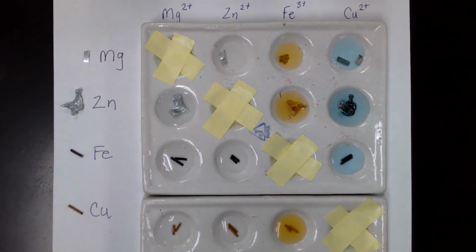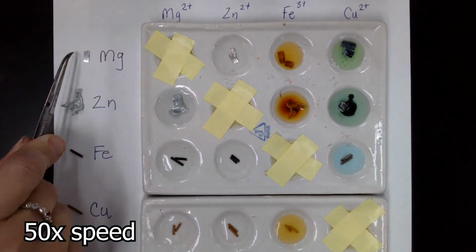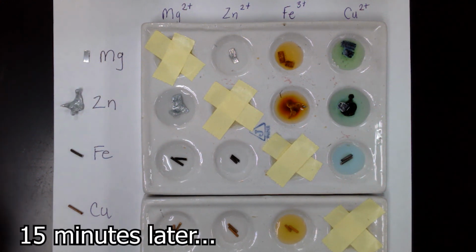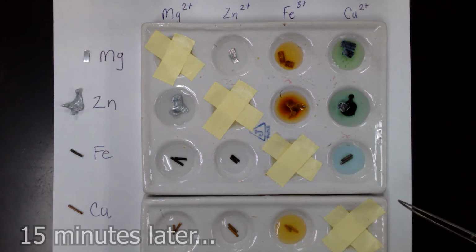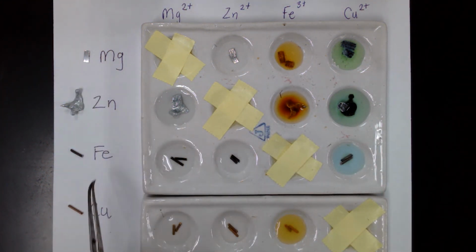Okay, so we're going to let this react, we'll leave this go for a while, and we'll come back and we'll take a look at our metals and see if we notice any differences in solution or differences that we see at the surface of the metals. Okay, so we've left these reacting in the well plates for about 15 minutes. So now we want to take our metals out and compare them to the original.